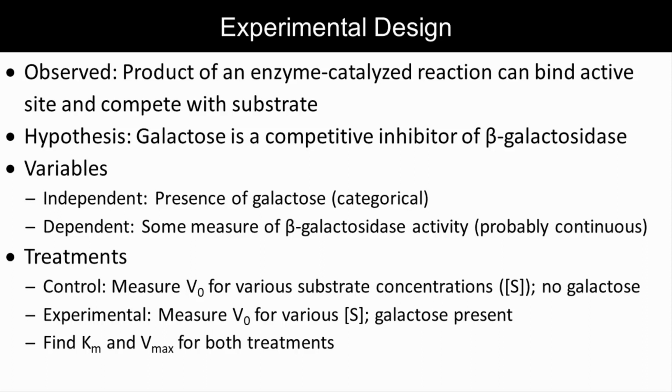For our experimental condition, we'll set up the same reactions but with galactose present and calculate the Km and Vmax there. If our hypothesis is correct, then, you know what? Why don't you tell me what the prediction should be in the pre-lab quiz, and I'll head to the lab.